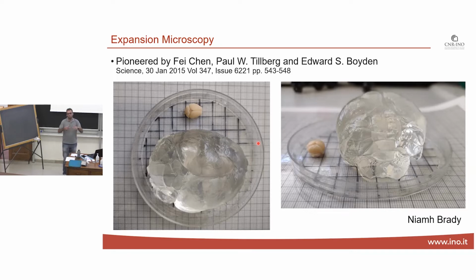There might be a distortion, but mostly the structures are maintained. Yes, you see the structures that are essentially magnified. Instead of magnifying optically, you make the sample bigger.